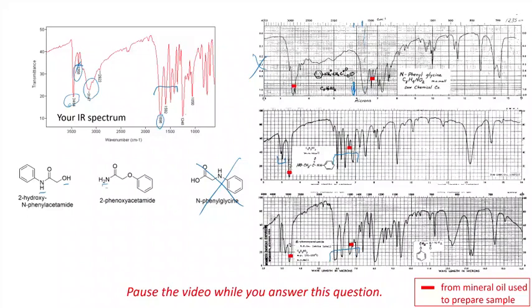So that's not clear that that's going to help us too much. We have a big peak at 1250. Now that's looking more like this one, perhaps. And between these two, we have 2 smaller peaks. See this one and this one. And we do see those over here. It's harder to say that we have anything of that nature in here.